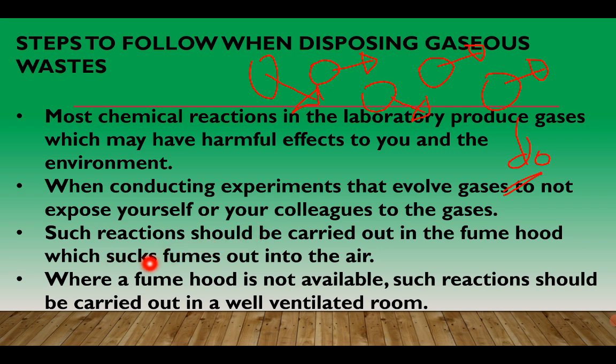But not all schools can have a fume hood. So where a fume hood is not available, such reactions should be carried out in a well-ventilated room. In this case, it means that the windows and the doors should be open when carrying out these experiments, so that when gases are released from chemical reactions, they are allowed to diffuse from the lab to the outside.